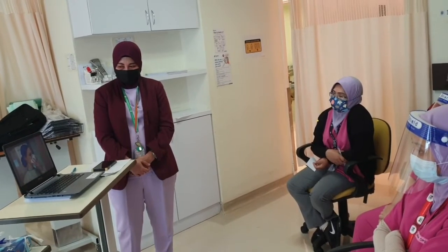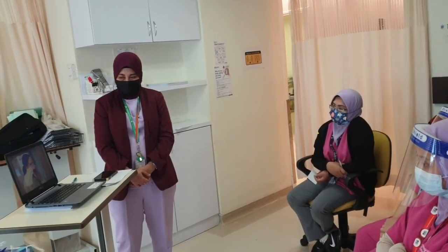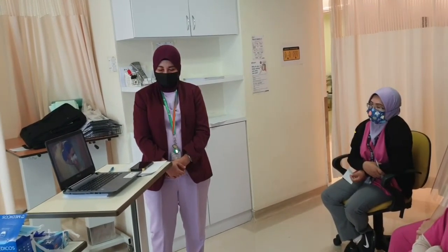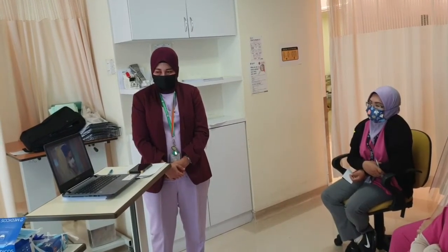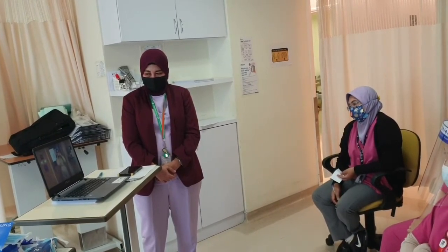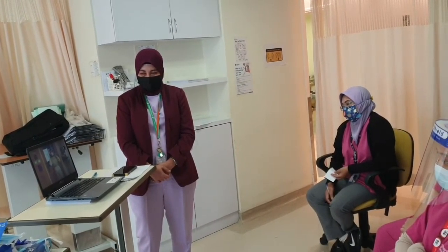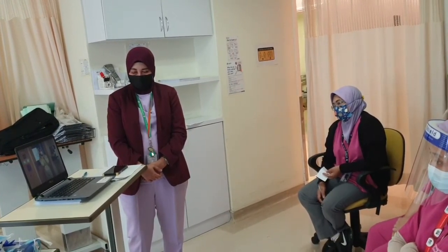Place your fit-tested N95 mask over your nose and under your chin. Place the top strap at the crown of your head. Stretch the bottom strap over your head to the back of your neck. Hold the nose strip to ensure a secure fit and tight seal. Without touching the mask, perform a seal check by placing your hands at the top and bottom while taking deep breaths to feel if any air escapes. If air is felt, readjust the mask for proper seal.